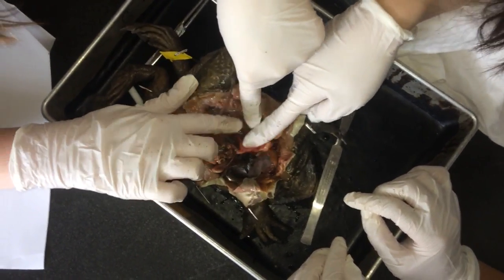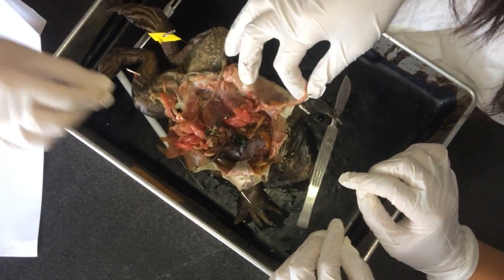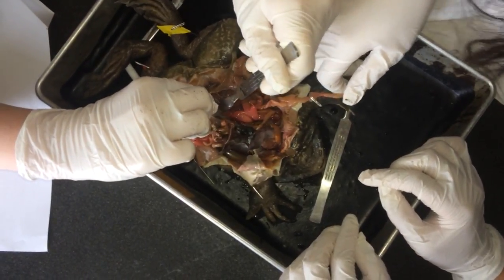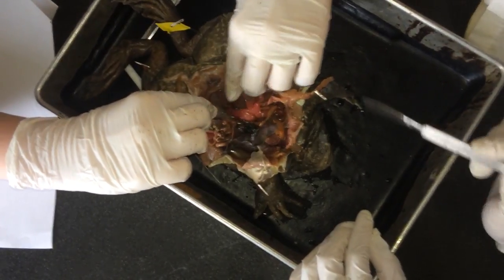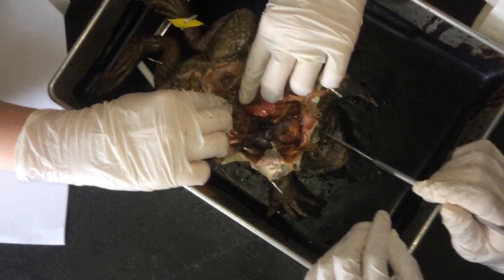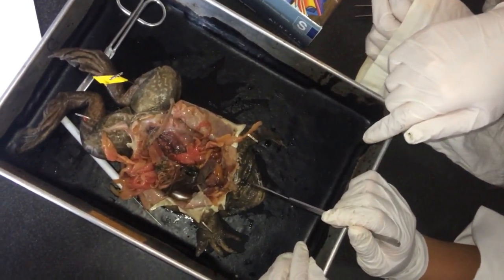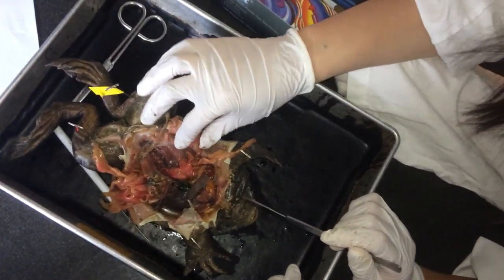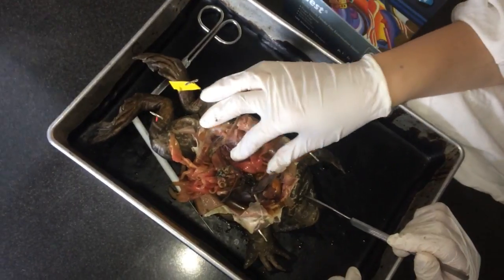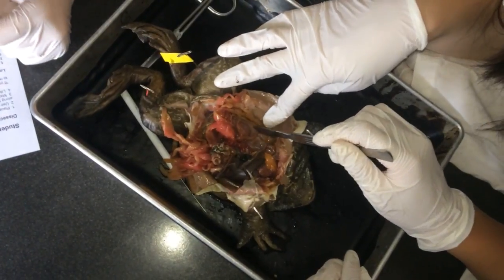Oh, it smells terrible. So what is this right here? I think that's the testes. That's a testy. Really? What does it look like? Located at... oh, we need to find the kidneys. Aren't the kidneys underneath stuff though? Like, why do we have to cut stuff out?